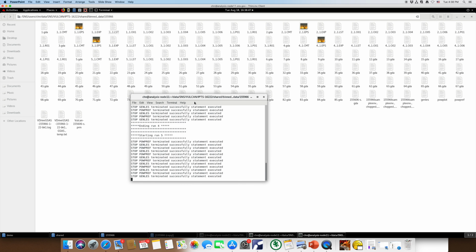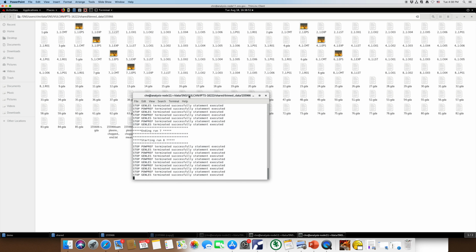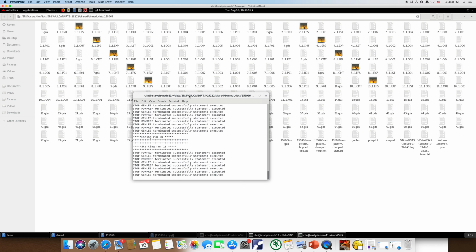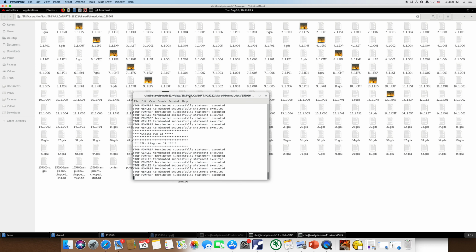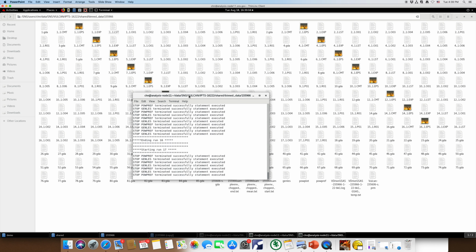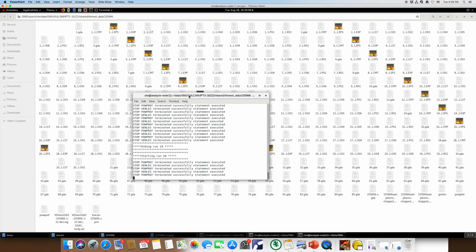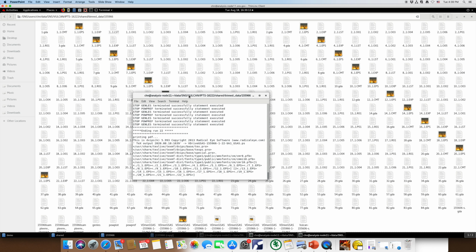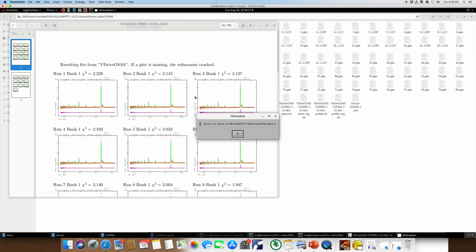It will take a while. Okay, we click this OK.